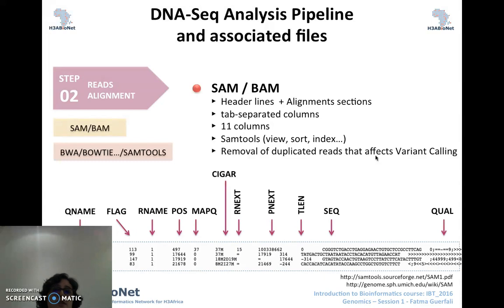It can contain extensive information about the read, its properties, its alignment to the reference sequence, etc. So it is a format that is really widely adopted today. In fact, that file can store the mapped reads, the unmapped, the flagged ones, the QC failed reads, etc. So you have a whole bunch of information that is related to it.